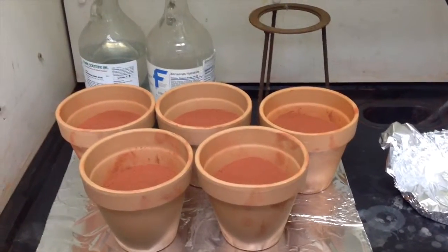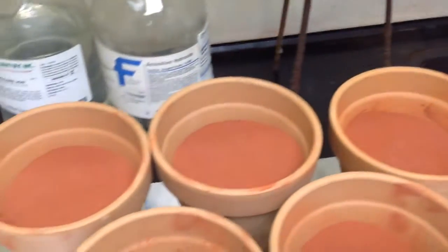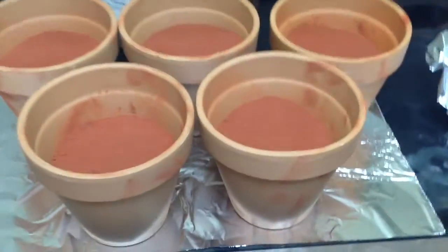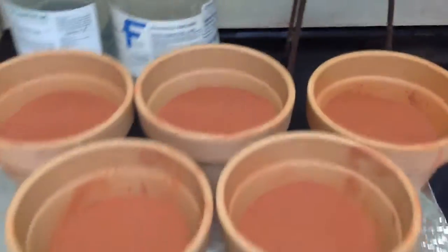Alright, and after all that, you can see where we ended up. Our flower pots are full of the mixture. Obviously this is nothing reacted yet, it's just the mixture of the iron trioxide and the aluminum. And I'll go ahead and cover that up with some aluminum foil to keep moisture out and all that. And that will be it.